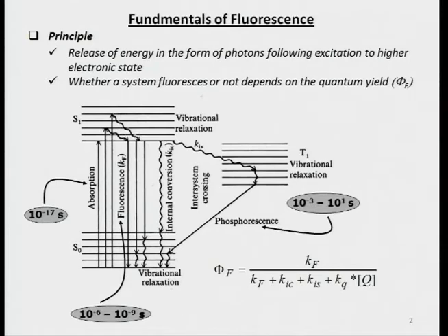That's typically true for most molecules. However, for some molecules, what happens is that it comes down from the higher excited state to the lower one through release of energy in the form of photons. So they actually release energy. The release of energy can typically arise from the lowest vibrational level of the higher excited state to any of the levels here. And that is called fluorescence. So this is what we typically utilize in numerous processes. These days, fluorescence is extremely well utilized.